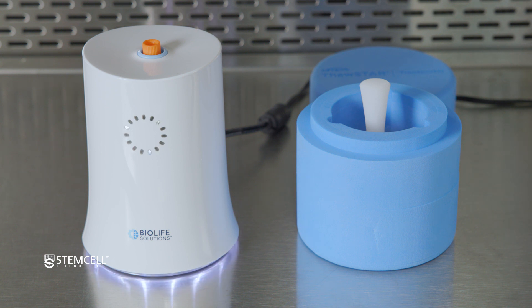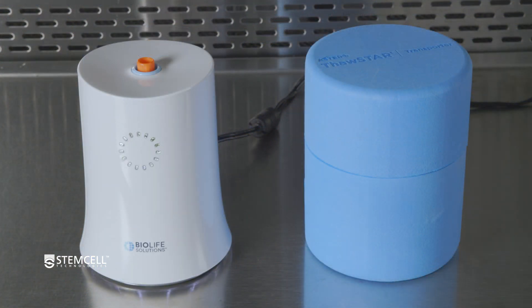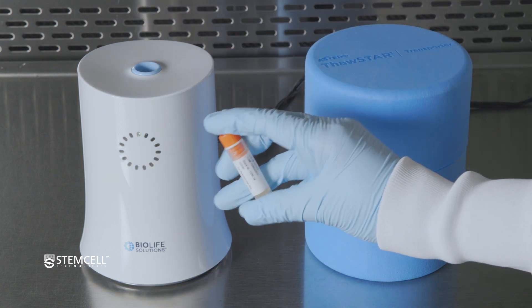Thawing will begin immediately and takes around 3 minutes. Be sure to stay close by so you can remove your vial immediately once the process is complete. When thawed, the light circle will flash and a beeping will sound for 10 seconds. Immediately remove the vial once it rises out of the insert.